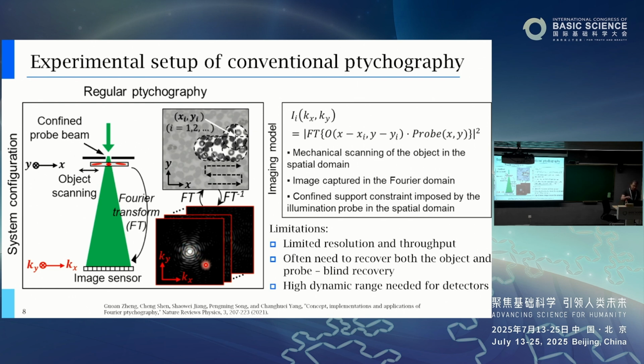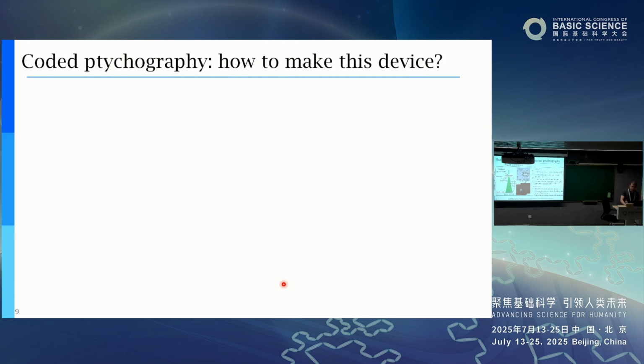My talk here tries to address all of these limitations. By doing that, we can really compete with the conventional optical microscope, and even have better throughput and resolution, and can also get quantitative contrast. So that is the motivation.